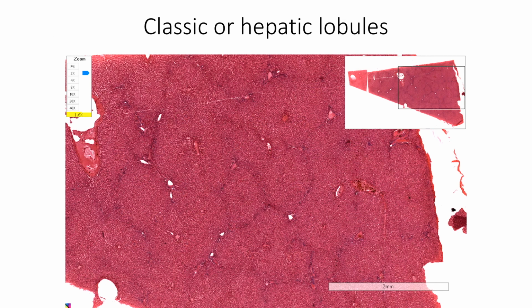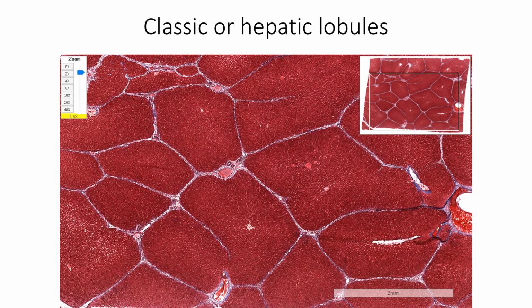So here we are seeing a section of liver showing the hepatic lobules. We are also seeing one hepatic lobule being marked by this line. In some species, hepatic lobules have well-marked connective tissue boundaries. However, such arrangement is not seen in case of human beings.